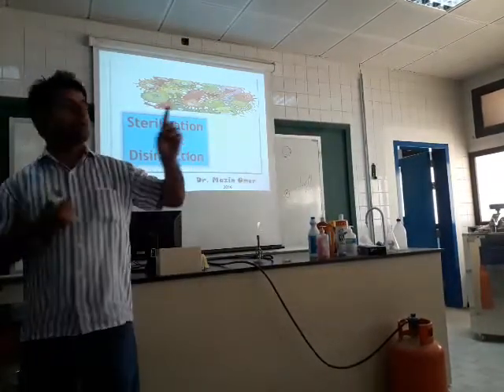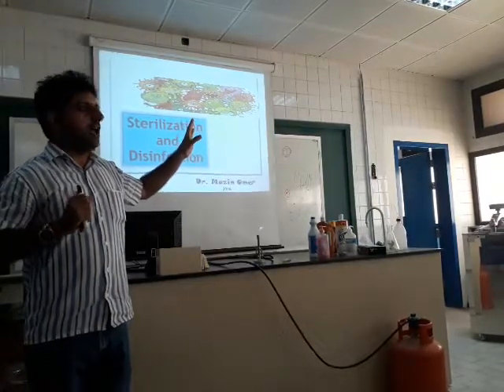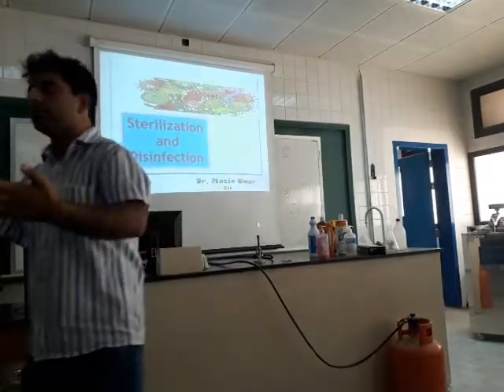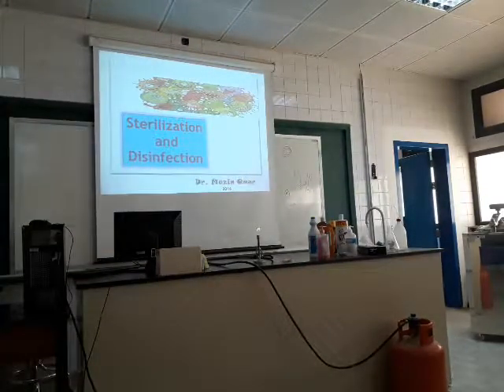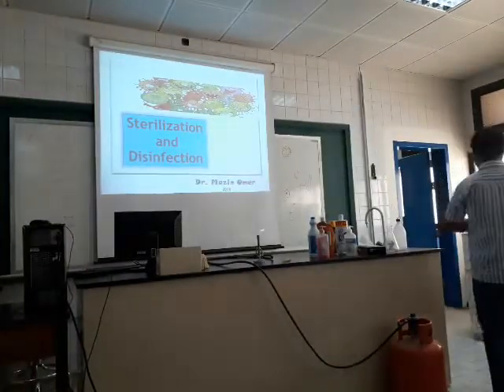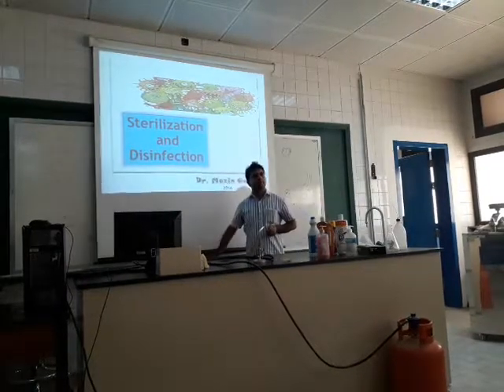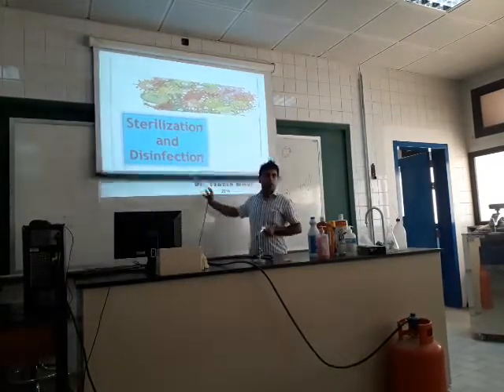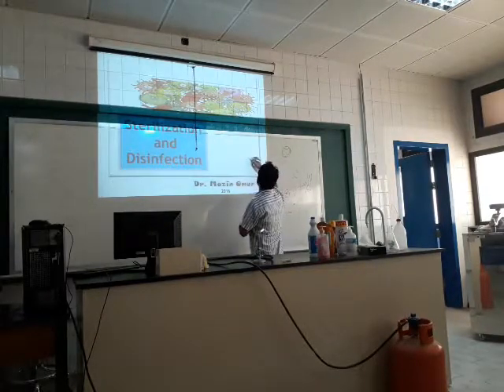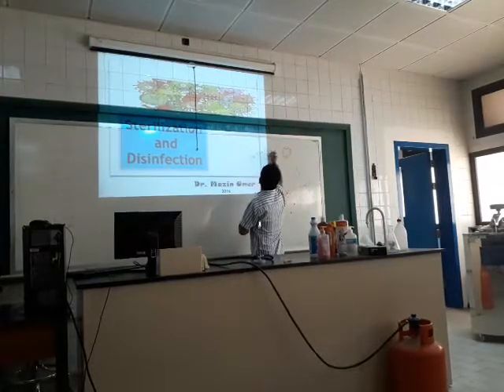At that time, we use the term sterilization. Various methods are available to get rid of microorganisms, or you can say to get rid of bacteria from the surface, or virus, okay?